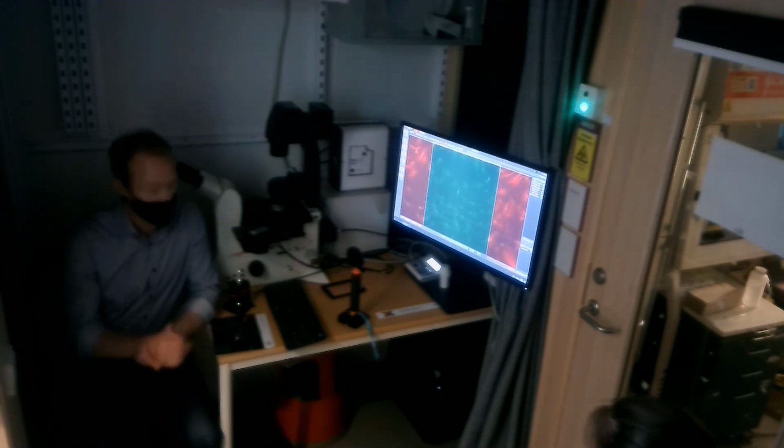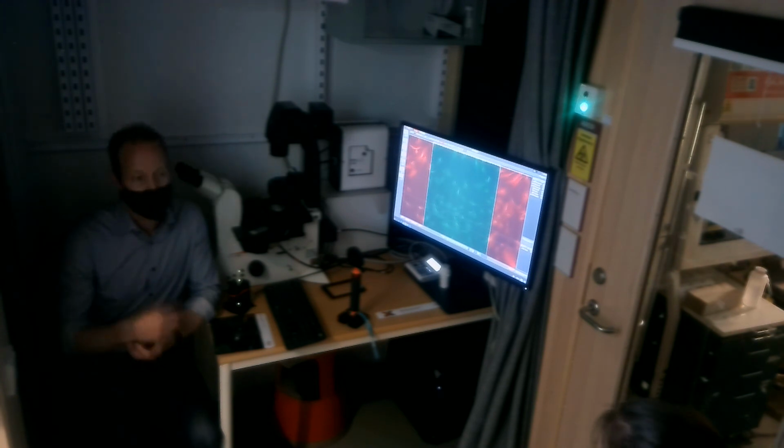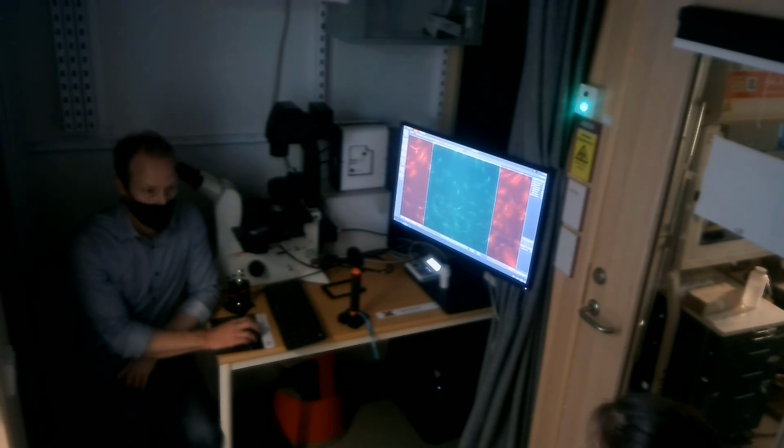It's a very simple upgrade, and it's called Synapse. If you have Synapse, the autofocus actually gets more functions. In that case, the autofocus would be a separate channel that you have full control over. So you could set up the autofocus channel with very little light and very short exposure, so it goes fast and so on.